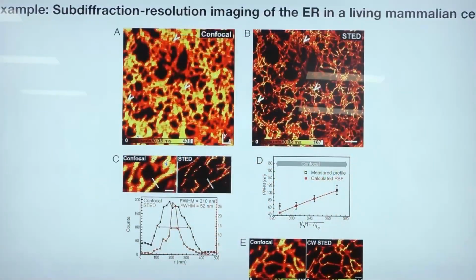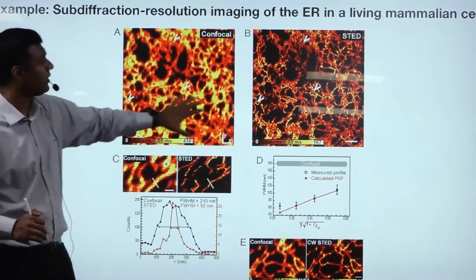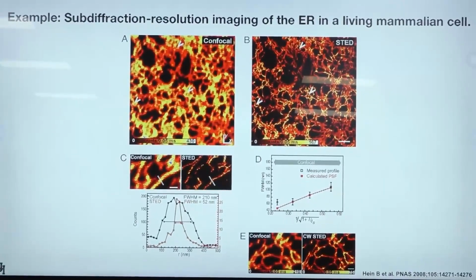And here are a few more examples of confocal and STED. You can see much finer biological samples. In the first few experiments, it was done on dead cells, or non-living cells, but people have extended it to living cells as well.